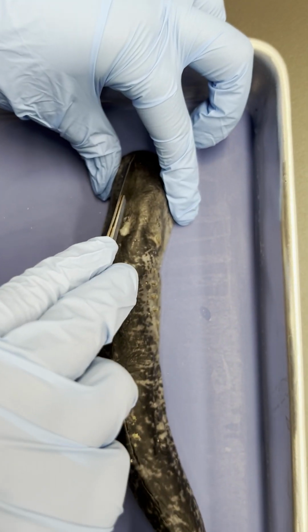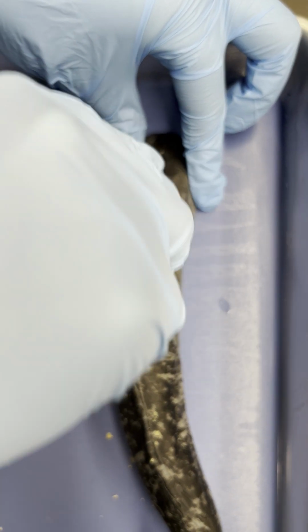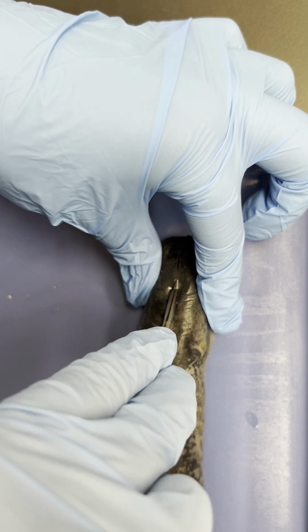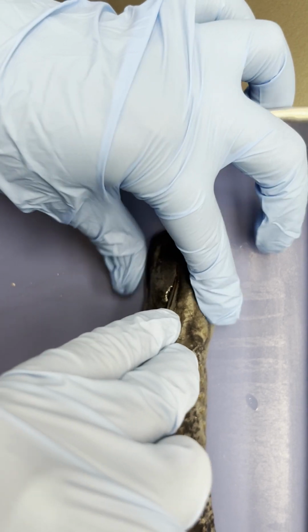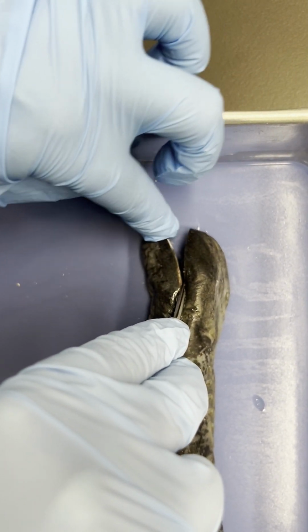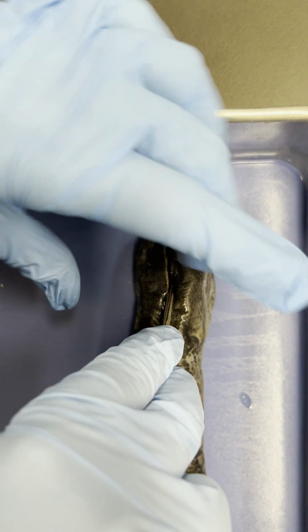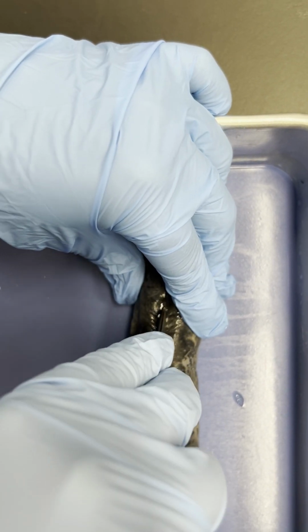It is a little extra challenging to cut around where the teeth are, just because those are a pretty firm structure. But if you press downward with your scalpel, that can help. Generally, we want to do a smooth slicing motion, but you do need to dig down a little deeper there when you're doing the teeth. But you can see how it's opening up, again, like we're opening a sliced hoagie. So we're just gonna go down.